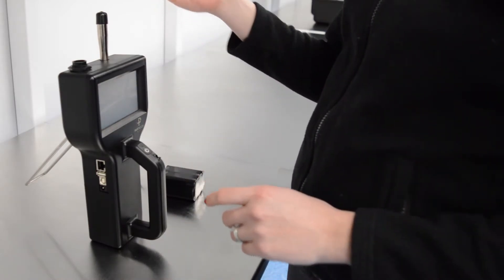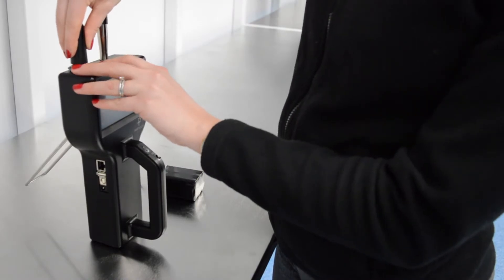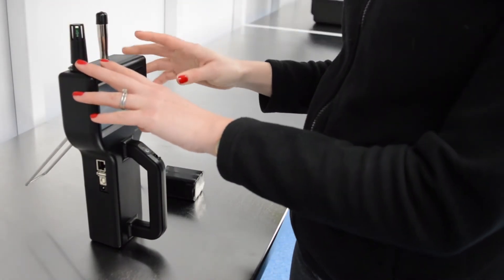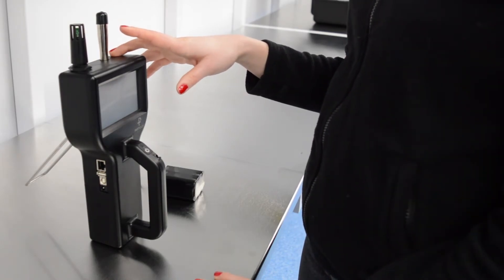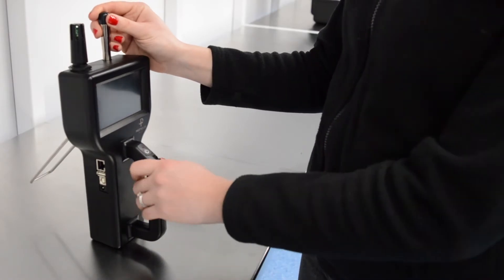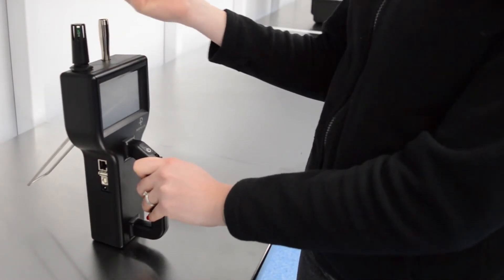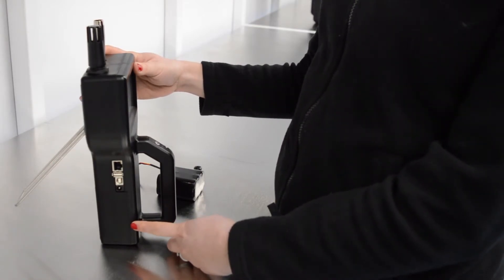Let's attach the temperature and humidity probe. You can see it has a keyway to ensure the correct orientation and it just easily slots in. There's a cover cap for the sensor probe, which is where the sample air is drawn in. You just need to remove this to expose the inlet for the air sample.